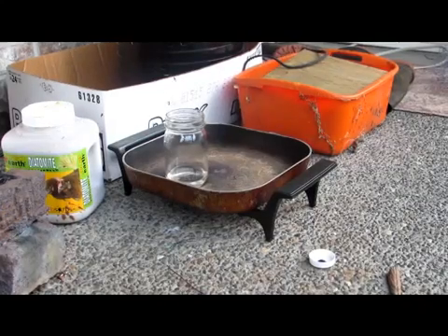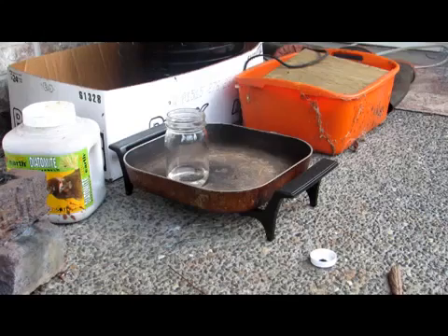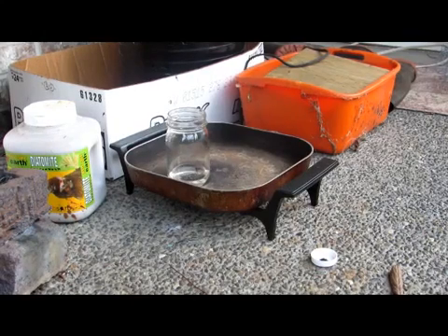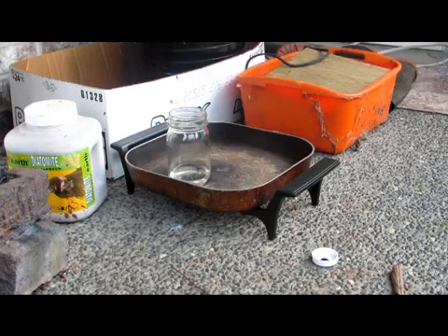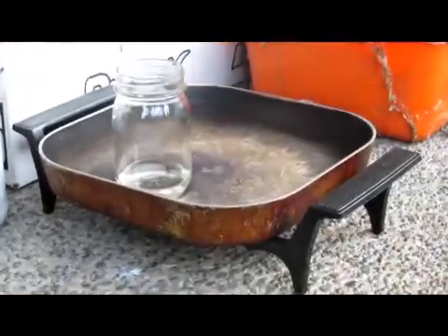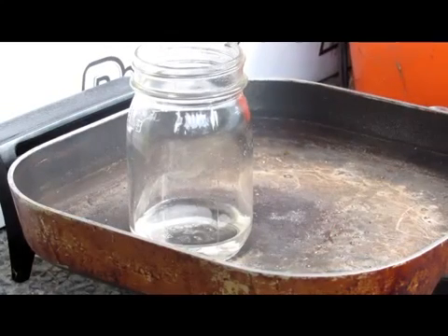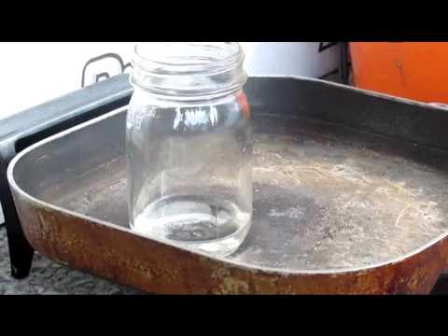You will know your sulfuric acid is done concentrating when either A, it stops boiling and no more gas is released, or B, if your burner is hot enough, then white dense fumes will be released. This is sulfuric acid vapor. But since my burner does not go that hot, there are no fumes, so it will just stop. The concentration is about 70% at this point, and there's your sulfuric acid.